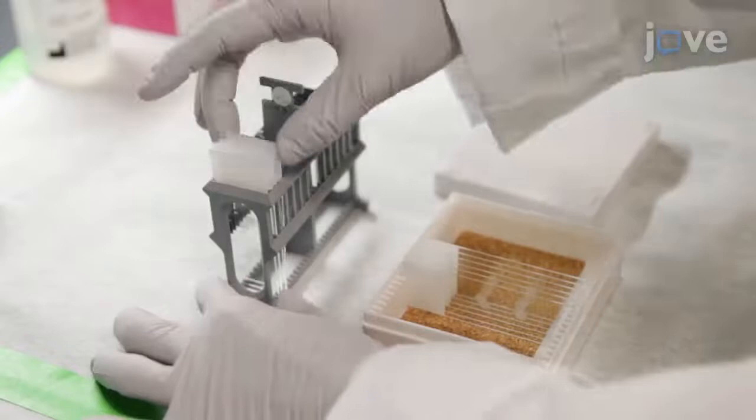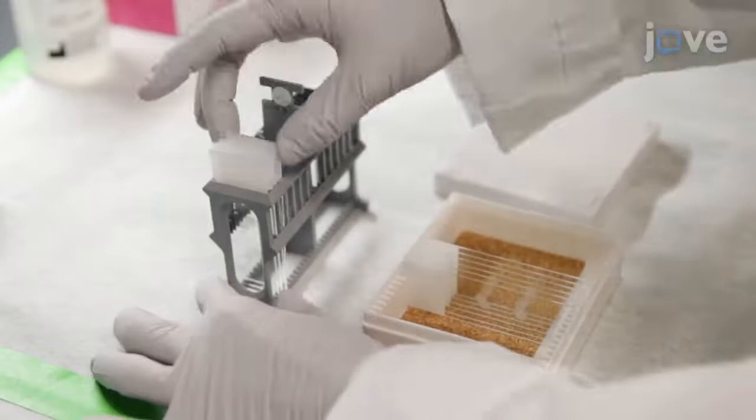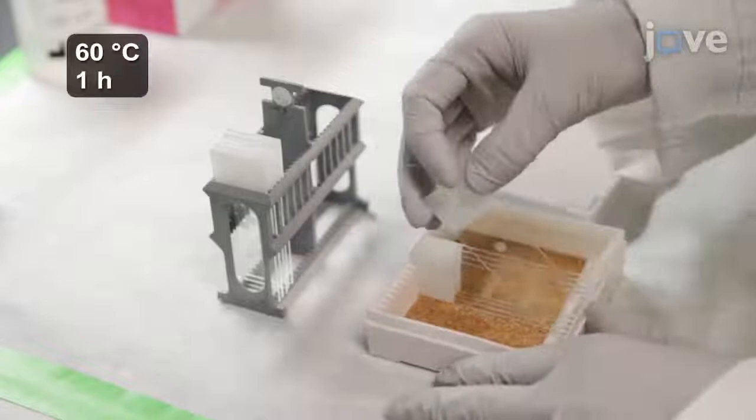One hour before performing the RNA in-situ hybridization assay, place the mounted tissue slides in a slide rack and bake in a circulating air oven at 60 degrees Celsius.